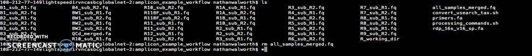Okay, so let's outline the steps that we will be undertaking in order to merge all the samples appropriately. And so first we will merge the paired reads for each sample into a single sequence. And then usearch will rename the merged sequences so that each sequence header now specifies which sample it originated from, which is useful because we're combining all the sequences into one file.